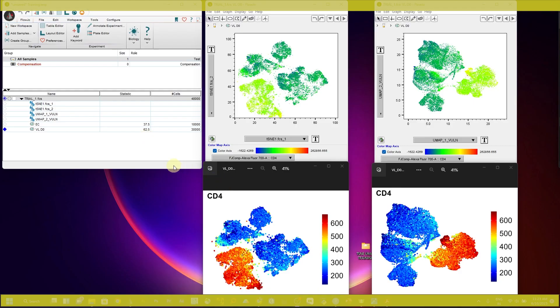Before using the R script, we need a data file from FlowJo. I'm going to show you how you can export the file of your t-SNE plot or UMAP plot from your flow cytometry experiment from the FlowJo software, so that you can use it for the transformation or colorization of your t-SNE plot as well as UMAP plot.